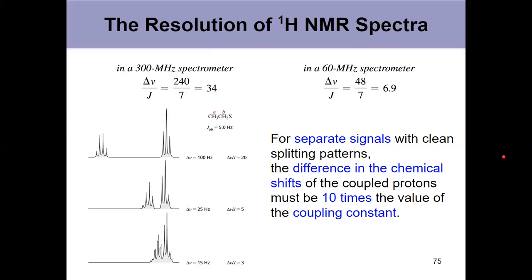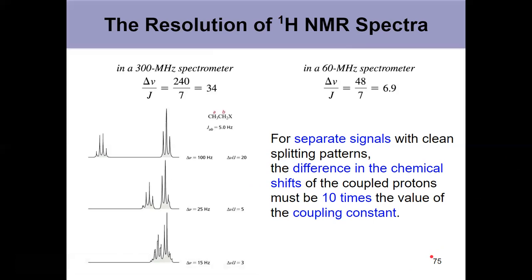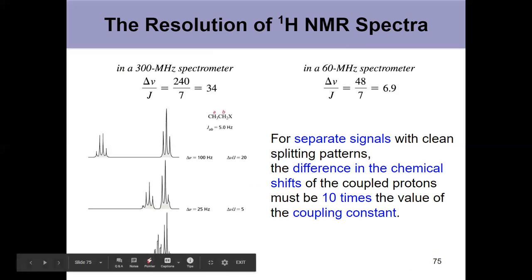We'll finish in our final video, part 5 of chapter 14, with NMR for things other than protons. Because everything in these first 75 slides and 4 videos has been proton NMR, but as we mentioned in the first video, there are other types of NMR as well.